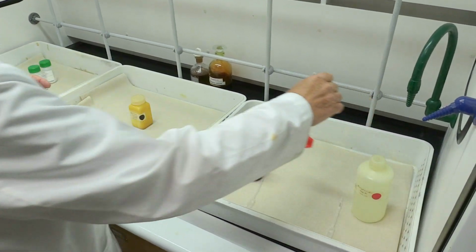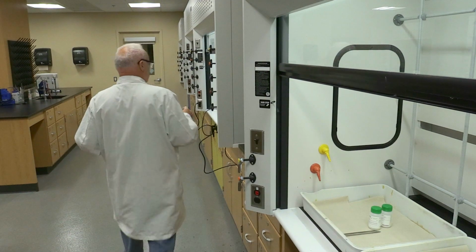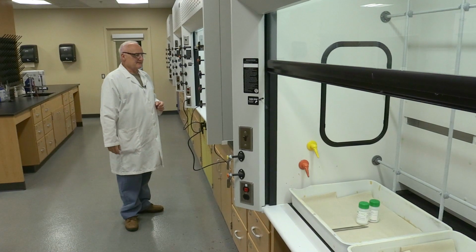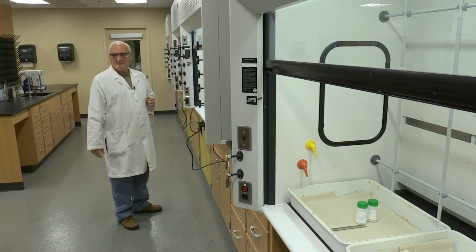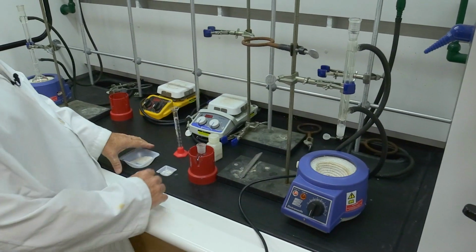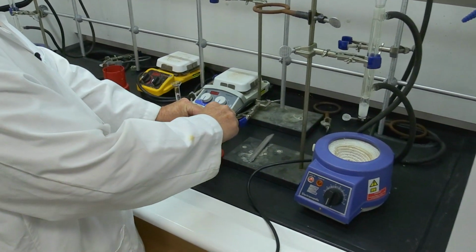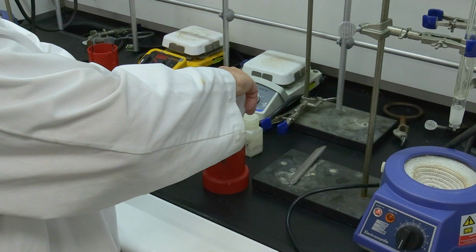The benzaldehyde and the benzyl alcohol mixed. So this is going to make benzyl fluorene, whereas part A is making benzal fluorene. Okay, so this is part B of the experiment. I pre-weighed the fluorene. We'll add it to the vessel.